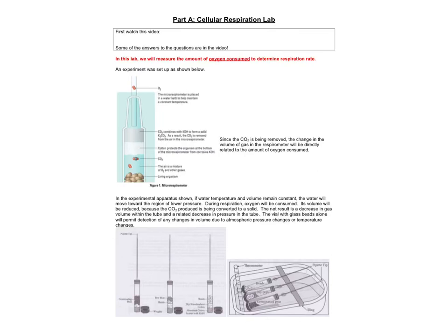This video is about the Cellular Respiration Lab, Part A. This setup, you'll realize, is a little bit old-fashioned, meaning it doesn't really use any nice equipment.